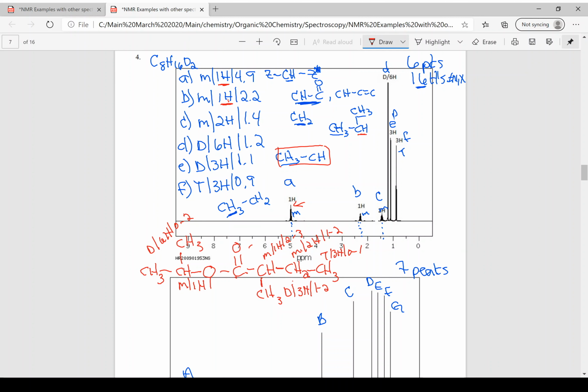Now this is the part that I'm going to have to live with. That should only be between 3 and 4. In other words, that 5 that I have, could it happen? Absolutely. It's one of those things that you choose one piece and sometimes it leads you down a crazy road. But this matches everything that I have in the proton NMR. So let's put some letters to go along with it.